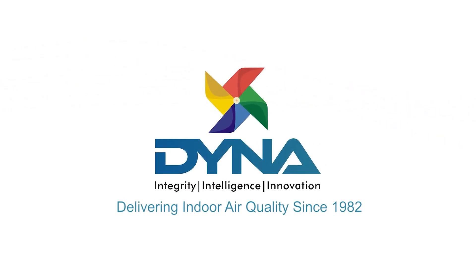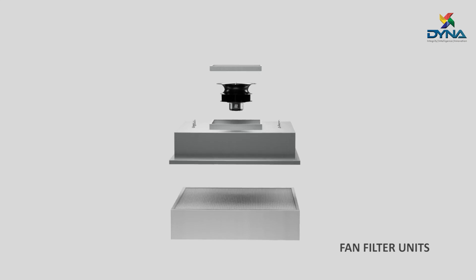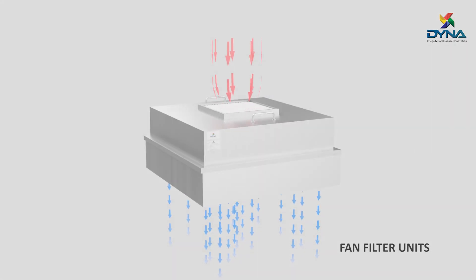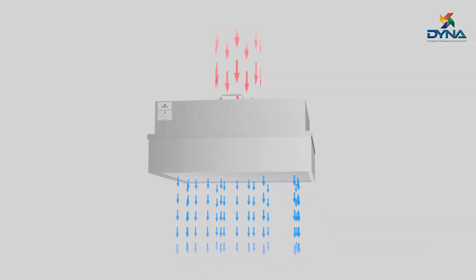Dyna — we are your trusted partner in delivering indoor air quality since 1982. Fan filter units are standalone units that supply purified air to clean rooms and laboratories by removing harmful airborne particles from the air at uniform velocity.